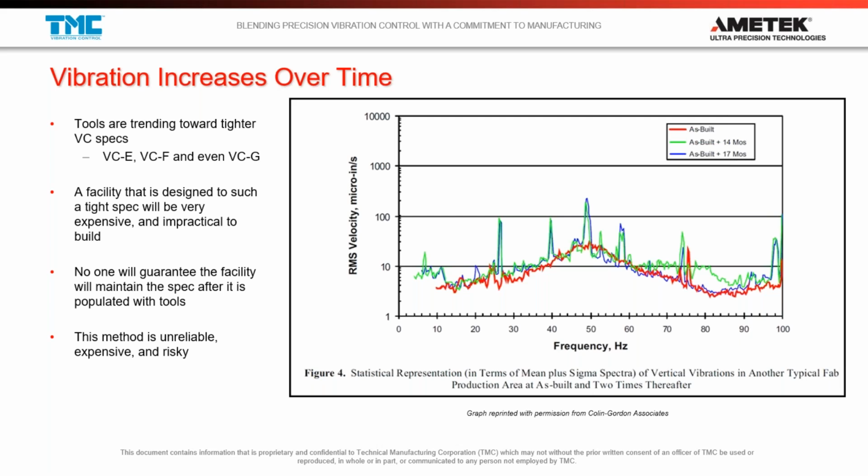And what makes this problem even more challenging is over time, you're going to want to be increasing your sensitivity to vibration because likely you're using a tool and you're advancing technology, and you're going to want to resolve smaller and smaller features. So vibration will, if it isn't a problem now, it probably will be in the future.